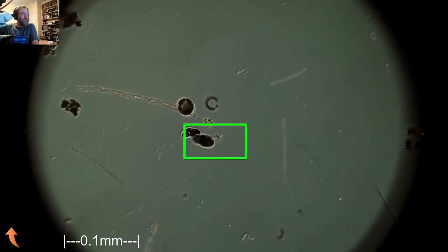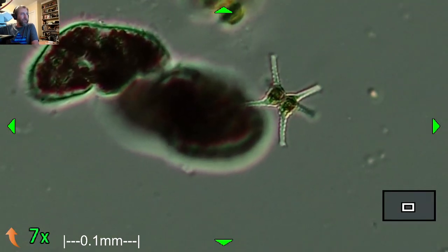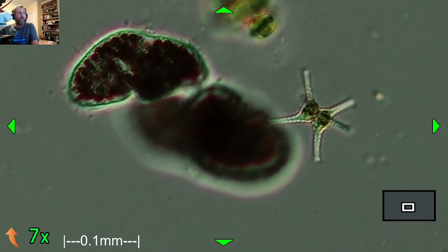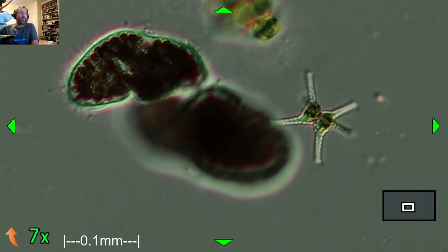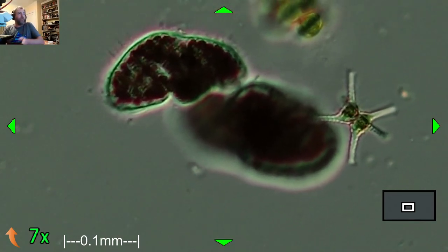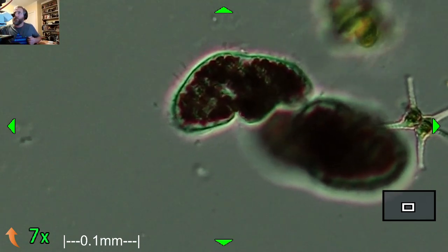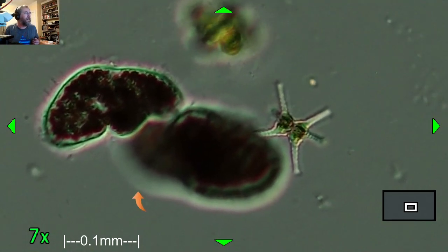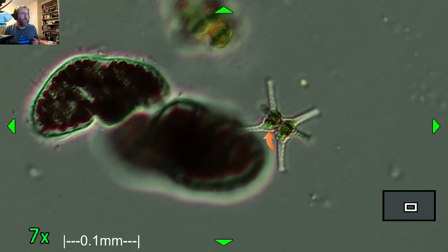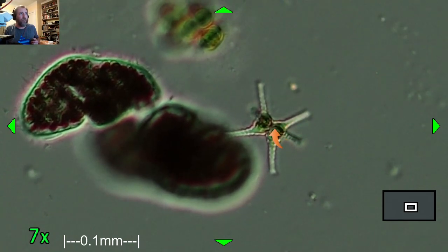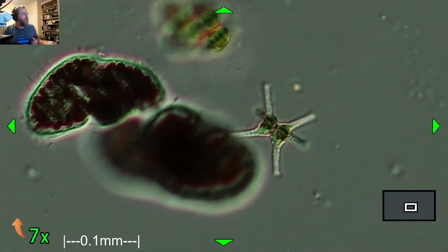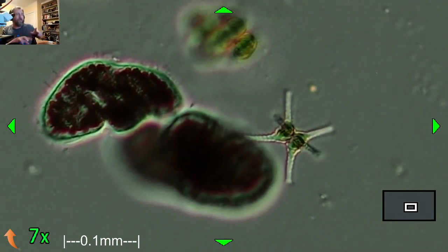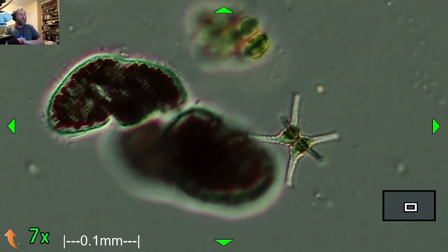And there's one of those little, here's your little Michael Jordan, Star Astrums right there. There's another one of them. You can see they actually have three little sort of radiating spines coming out of each half. And then like all the Desmids, there's sort of like two halves that fit together that are identical on both sides. And so that's Star Astrum. Yeah, like two tripods that are basically connected. So kind of cool. And kind of a cool shape.